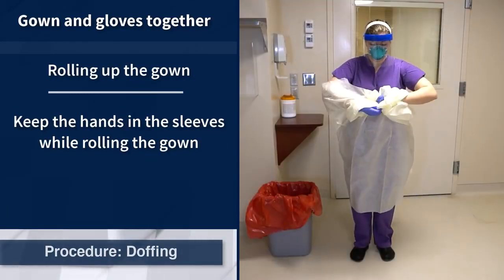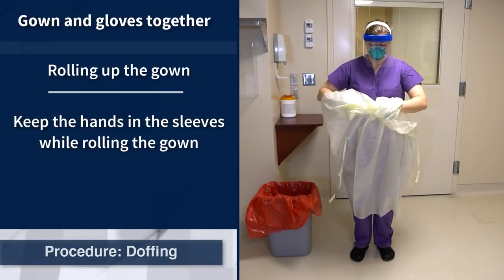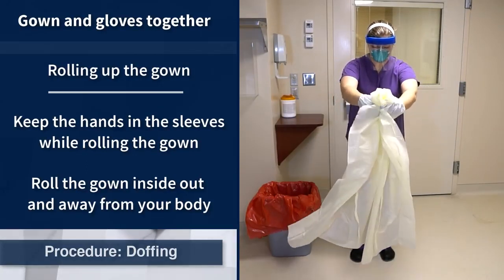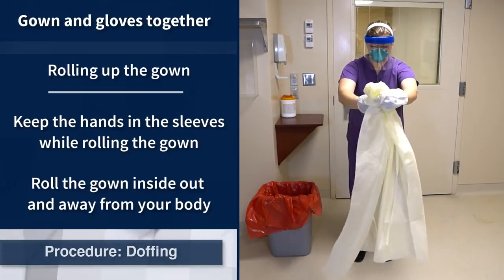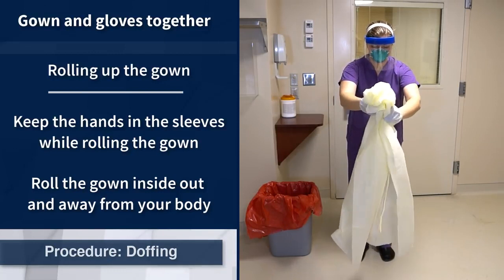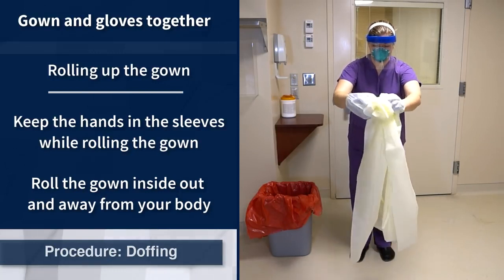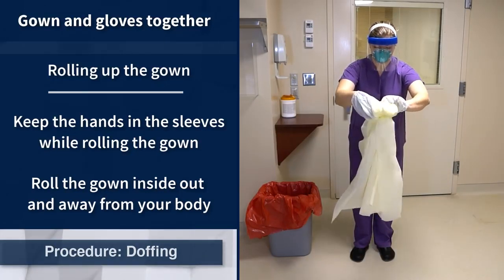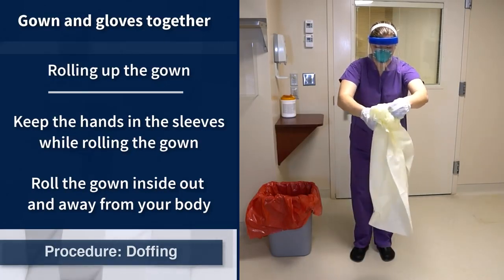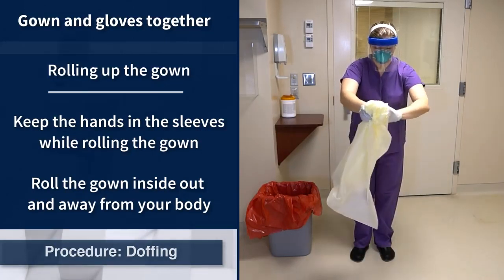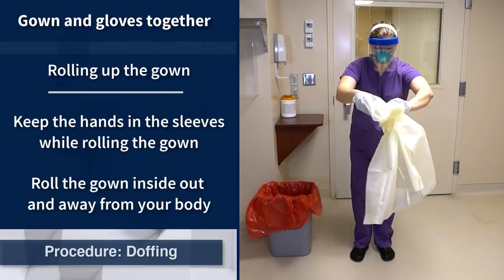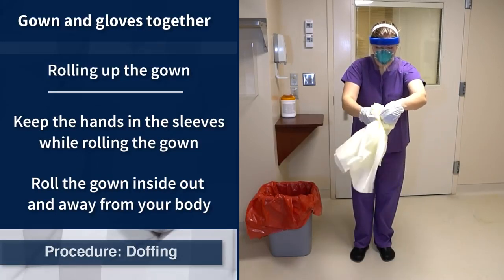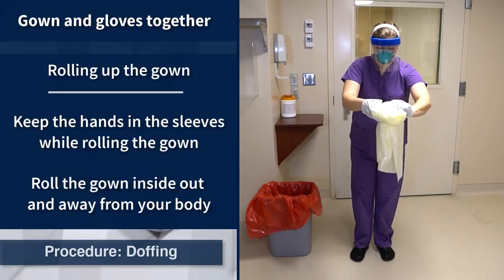Next, keeping the hands in the sleeves, roll the gown inside out and away from the body. Bending slightly forward will help keep the gown at a distance. Once the gown is rolled up, pull the hands out while removing the gloves with the sleeves, one arm at a time.